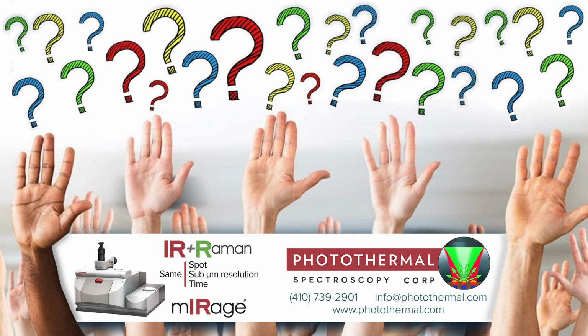So I used the plastic spectrum and the known Raman bands of the polystyrene to calibrate every spectrum from microplastics. And then I got very high accuracy in the wave number axis, and good accuracy in the intensity axis was achieved by the intensity calibration with this white light accessory from Kaiser Optical Systems. But there was no bandwidth difference.